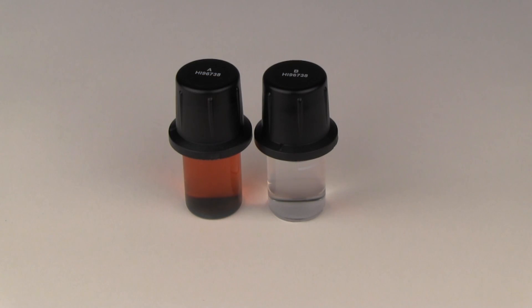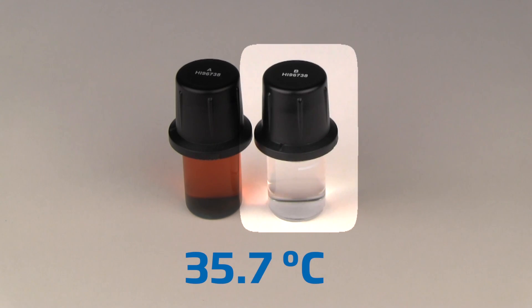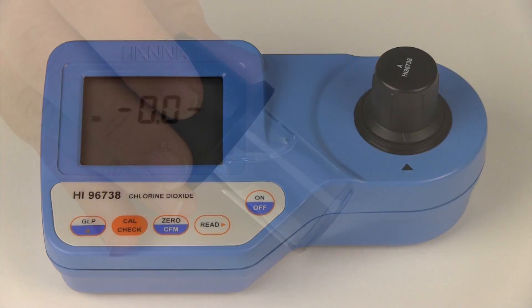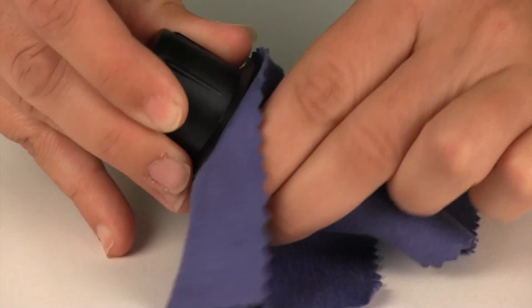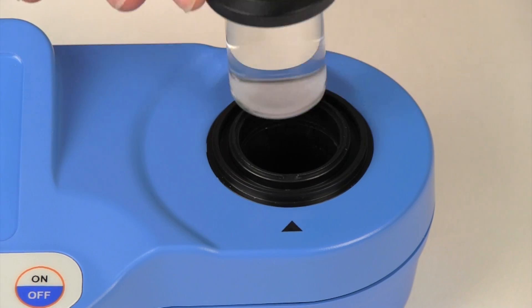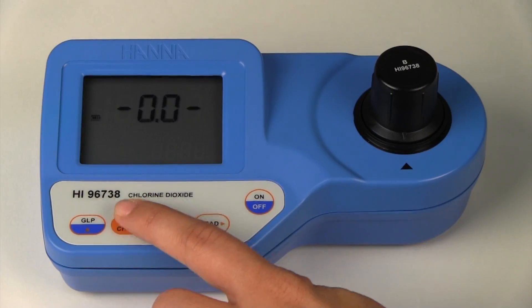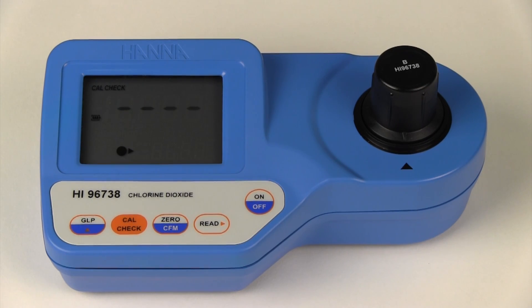Now we are going to move on to a one milligram per liter standard that has been warmed to 35.7 degrees Celsius. We will zero the meter. Wipe your standard of any dust or prints. Place the warm standard into the meter and perform a calibration check. The warm standard reads 1.21 milligrams per liter, which is higher than the expected value of 1 milligram per liter.